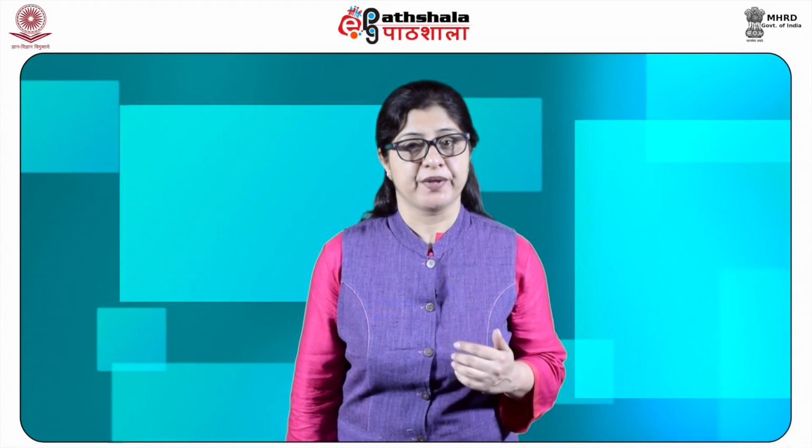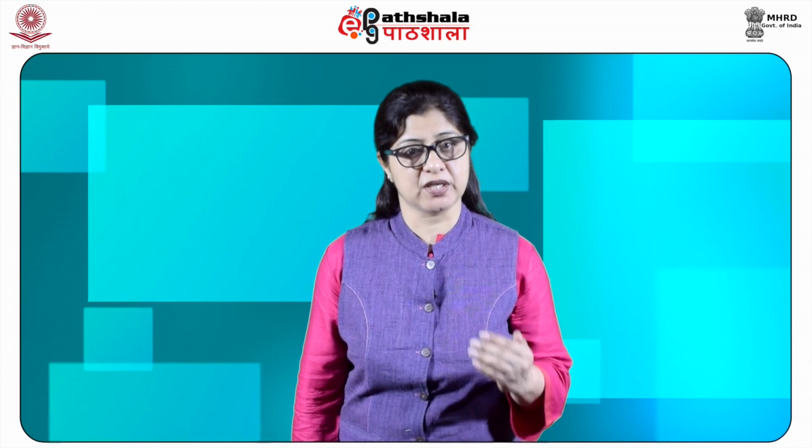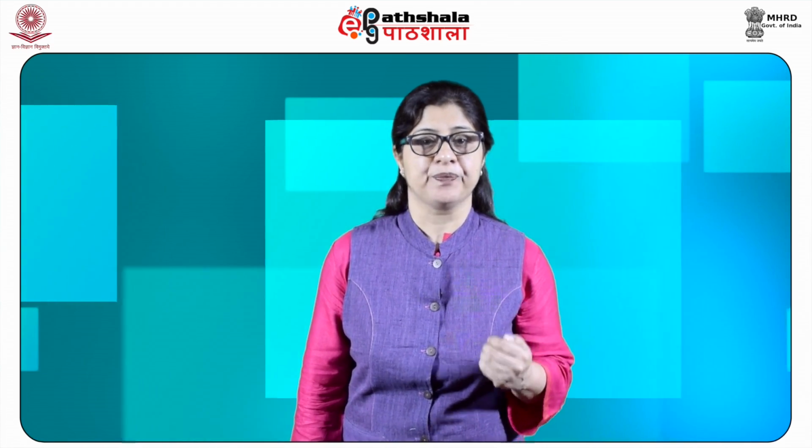Ion exchange separations are mainly carried out in columns packed with the ion exchanger. There are two types of ion exchangers, namely cation and anion exchangers. Cation exchangers possess negatively charged groups and these will attract the positively charged molecules. These exchangers are also called acidic ion exchange materials since their negative charges result from the dissociation of the acidic group.